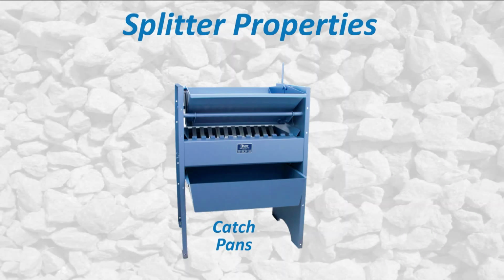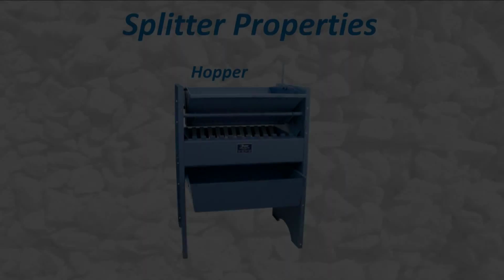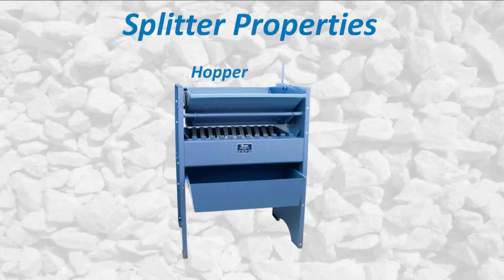The splitter shall be equipped with at least 2 receptacles, or catch pans, to hold the 2 halves of the sample during splitting. It shall also be equipped with a hopper or straight edge pan with a width equal to or slightly less than the overall width of the assembly of chutes, by which the sample may be fed at a controlled rate into the chutes.